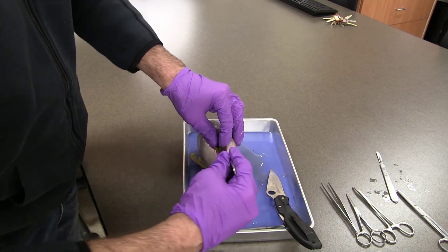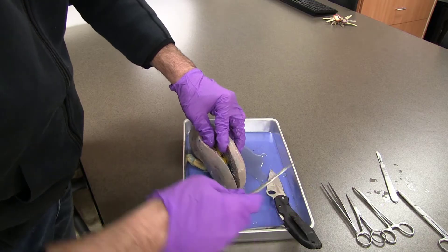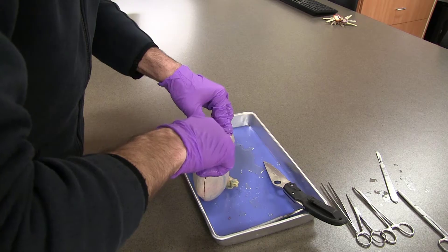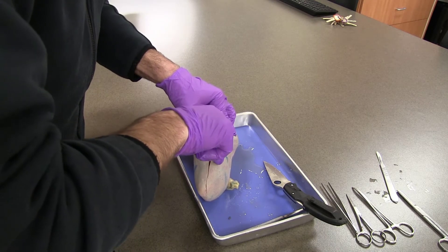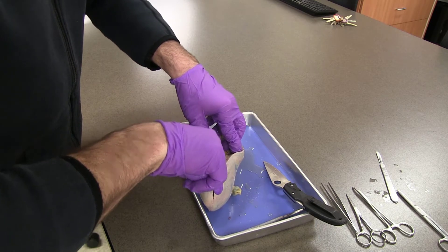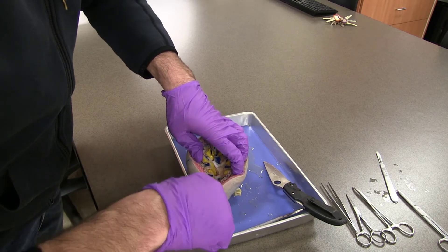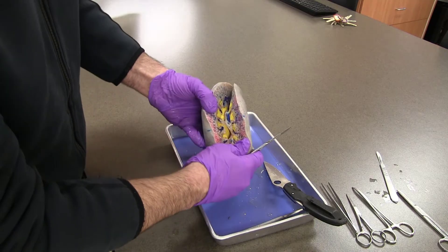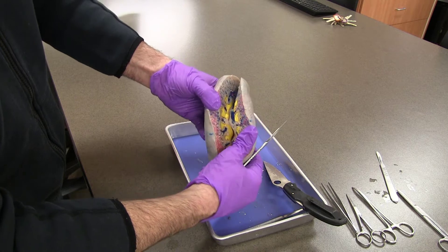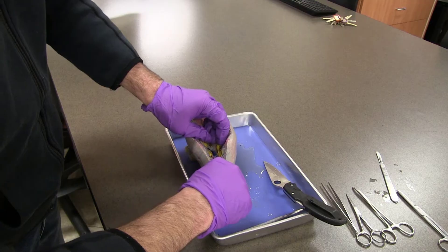I'll at least get into some of those calyces — major and minor — to show where the urine would be found. That actually worked out well as far as the area that we're getting into. I'm just going to finish up the cuts, and we'll be able to see major and minor calyxes on each side.